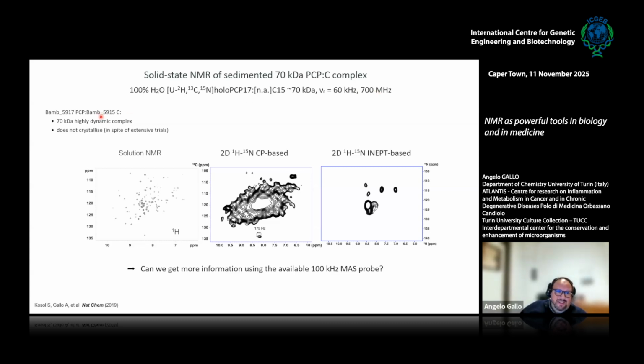I have to mention that it's a highly dynamic complex, and in spite of extensive trials, it does not crystallize. We tried extensively, but we couldn't crystallize. So you can see the quality of the spectra. Solution state NMR: nice and sharp peaks. The CP-based solid state NMR: a bit overcrowded and not so nice. The INEPT-based experiment, so basically the solution state NMR experiment applied in the solid state, shows basically few signals.